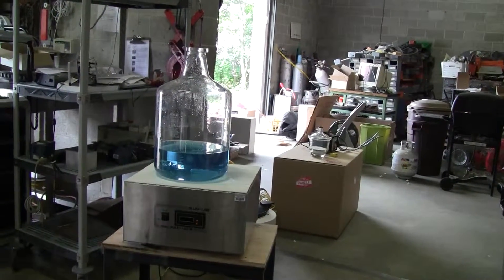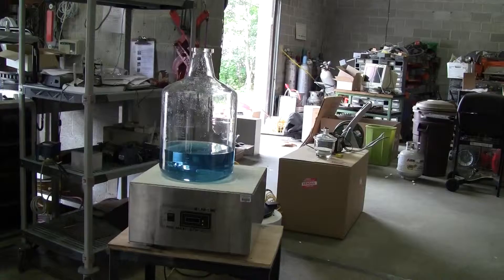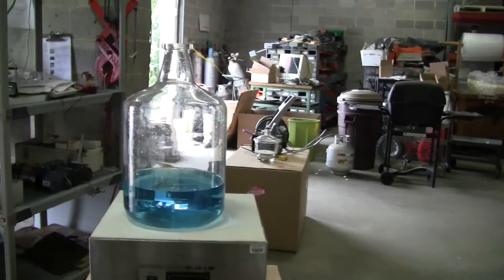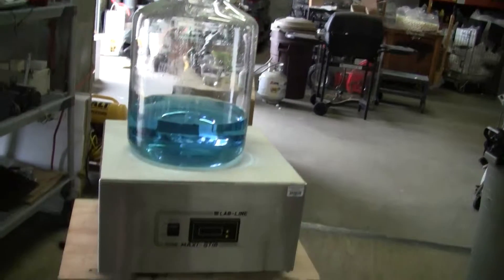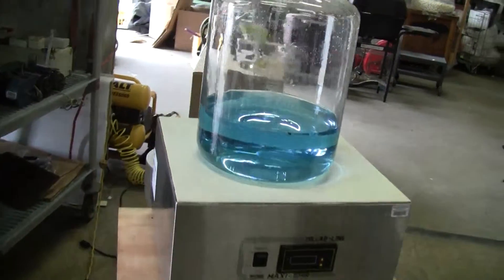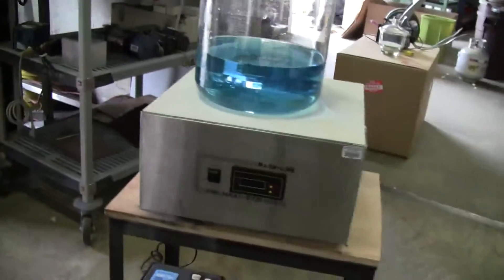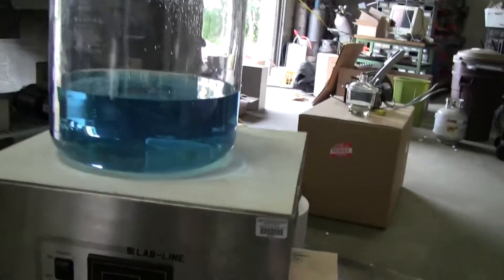Hi, this is Jim from HitechTrader. Today we're looking at a Labline Maxi stir, magnetic stir model 1295. It's got an 18 by 18 inch top, electronic controls.